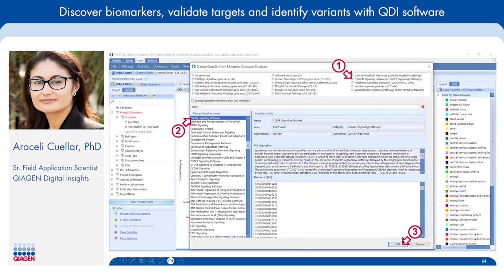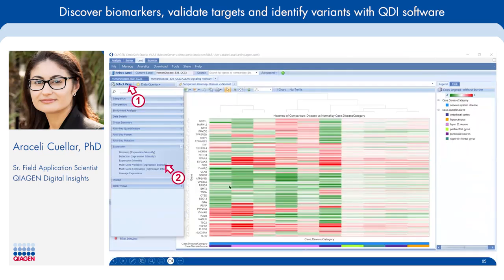So here, when you click on OK, this is going to query the expression of all of these genes. In this case, if we focus on our 2 projects, it's going to query on these 2 projects that we filter for. And so that's going to generate a heat map, just like we did when we searched for those 9 genes.